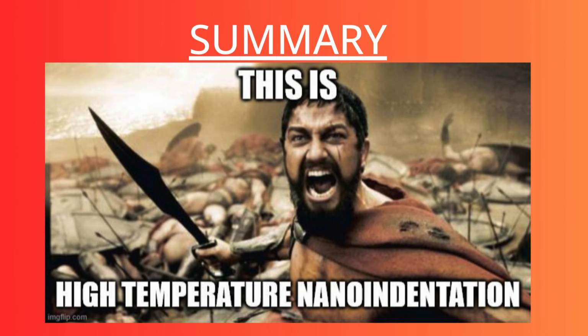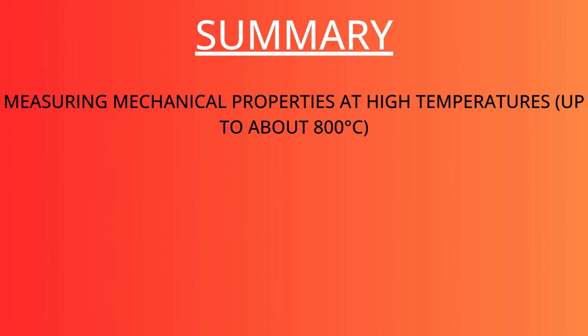Okay, now to sum things up. What even is high temperature nanoindentation? Well, it's a technique to measure mechanical properties, such as hardness, Young's modulus, or creep, of materials at elevated temperatures at a nanoscale. Those temperatures can vary to about 800 degrees Celsius.